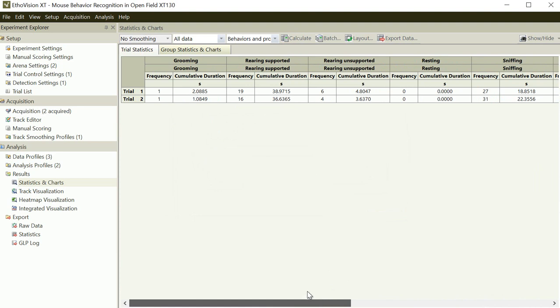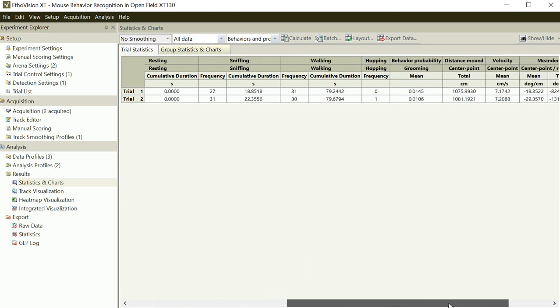Because we are using completely the same video, this should be the same. But the reason why these are a little bit different is that the starting point of the acquiring is different. But anyway, this video is quite identical.